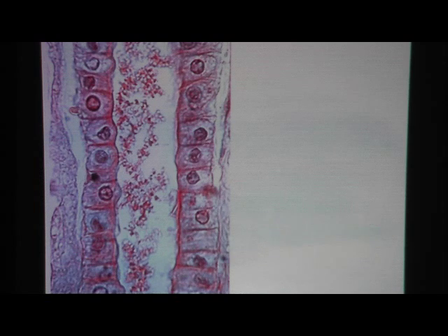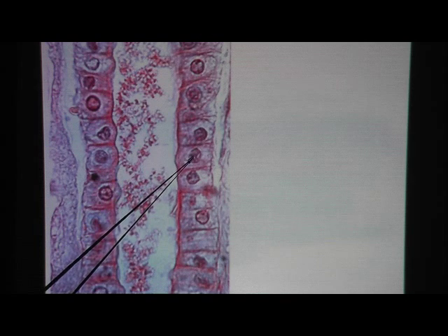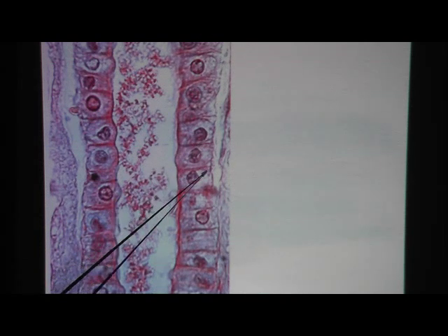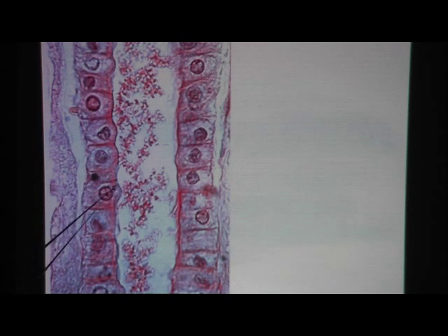Here the tubule is running up and down, and we're looking at the side of the tube. You can see nucleus, nucleus, nucleus — a nice structure for the plasma membrane or cell membrane. The shape is pretty square and there's only one layer, so this is simple cuboidal epithelium. There may be some debris or red blood cells visible in the lumen. This is probably kidney tubules.